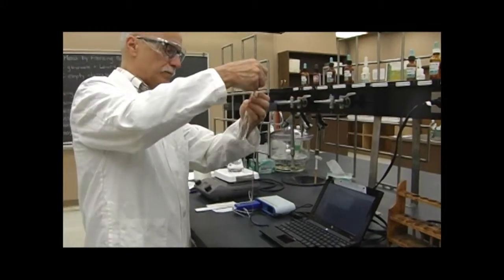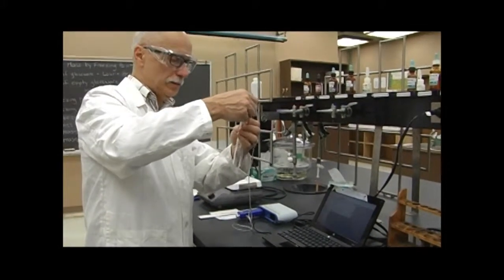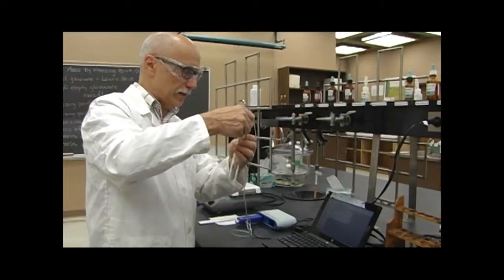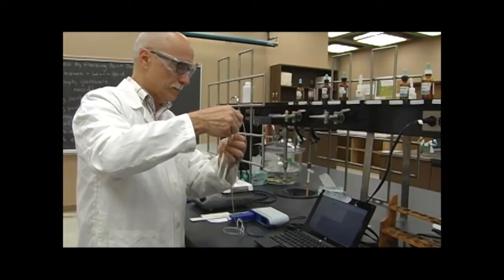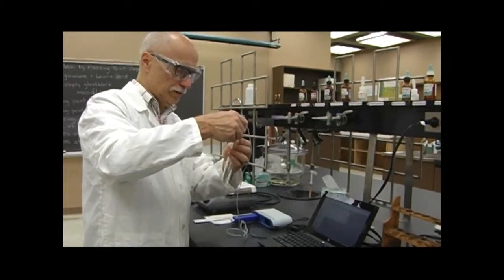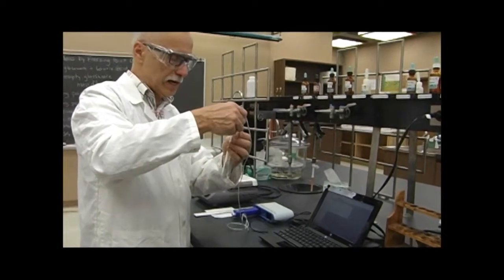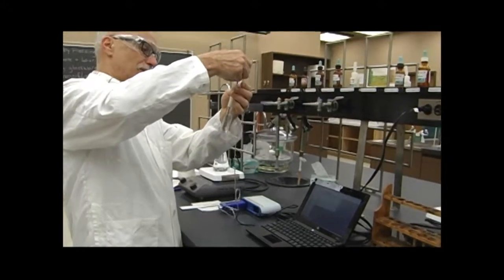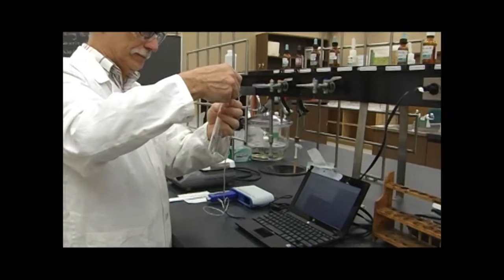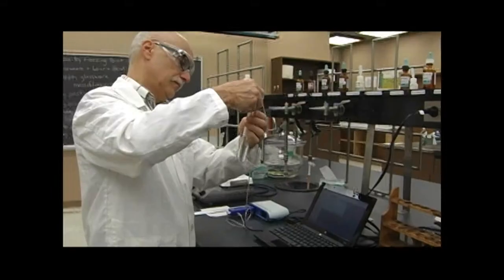So the freezing point depression is dependent upon how much lauric acid I had and how much unknown I've put in, to fulfill the equation, delta Tf equals Kf times molality. Down to 41.1, and no slush yet.